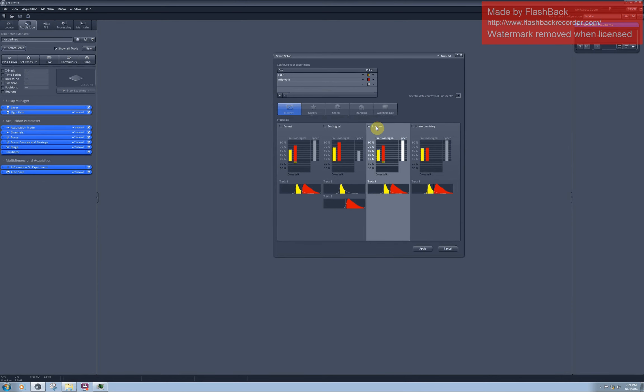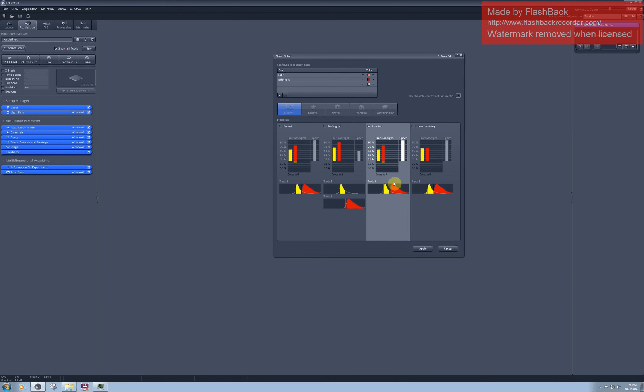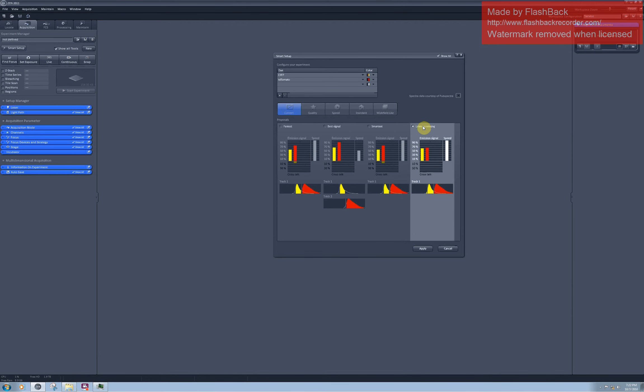The smartest option is usually a compromise between the best signal and the fastest possible scanning. In this case, the software decided that 5% of crosstalk is nothing, so you can actually just simply go with the fastest option. Again, please remember that this 5% estimation is based on the idea that yellow and red fluorescent intensities are the same in your sample. There is also a linear mixing option which we will talk about later. In this case, I'm going with the best signal. I select it and then click on apply.